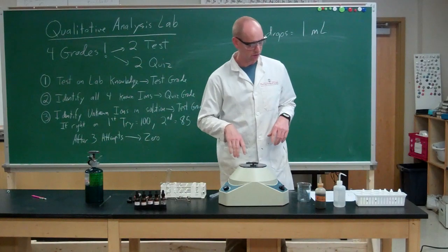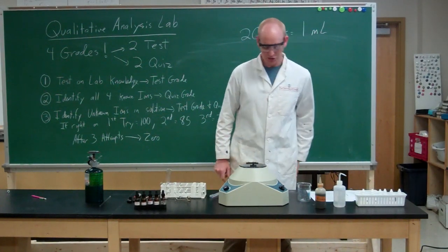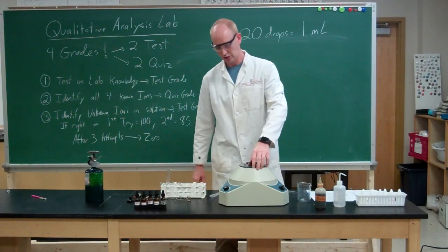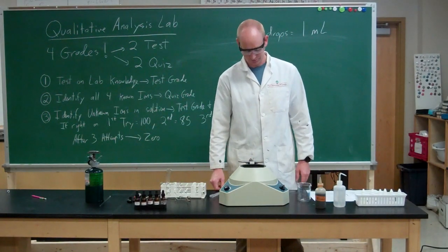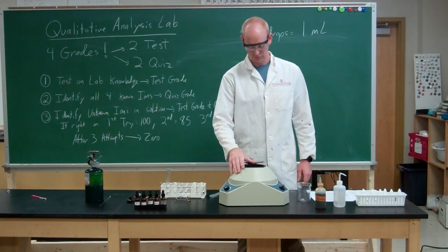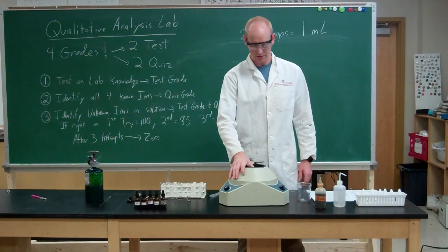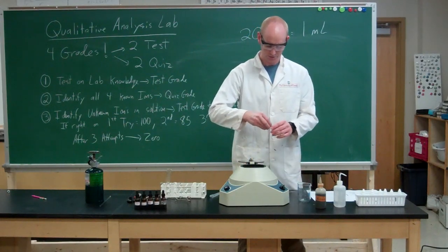This hadn't been 2 minutes, but I'm going to stop it a little bit early, because I'm not going to completely separate it, just for demonstration purposes. Let the thing stop on its own, and when it does, it takes a minute. We can pull out our test tubes.